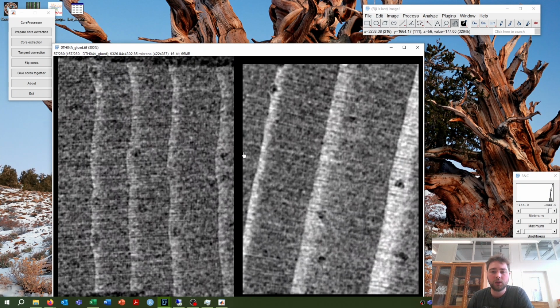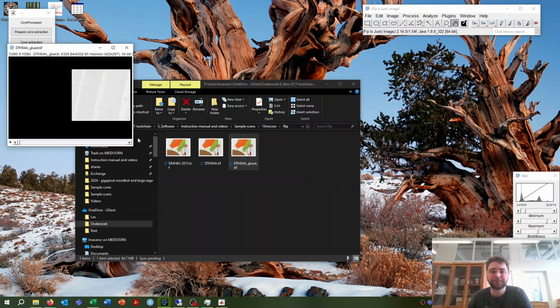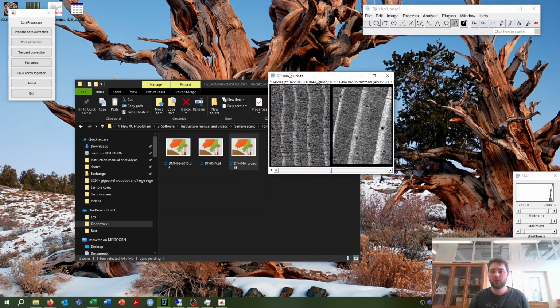Okay. What else? These files were all made in such a way that we can also do more complex editing in ImageJ and save them, and that RingIndicator will still understand. So, for example, I again load this file in ImageJ. So in ImageJ you can, for example, reslice, or make straight, or crop, or do whatever.